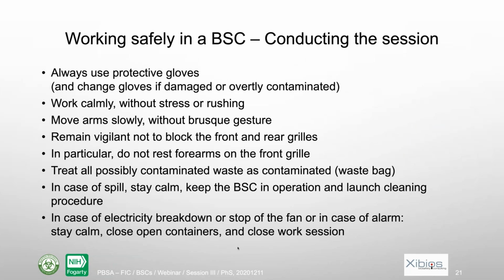When conducting the work session, you also need to take a number of precautions. You should always use protective gloves. That means that if they are damaged during the course of work, or overtly contaminated, you should change them. You should always work in a calm way without stress or rushing. Having a work session in a biosafety cabinet is not something that we do in 15 minutes between 2 meetings. We need to be sure that we have enough time to do things properly. So it has to be planned, and you should plan for enough time. Then we should move arms slowly, without any brusque gesture, without any rushing or anything.